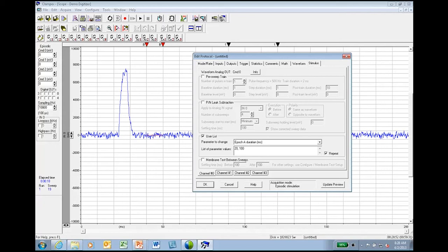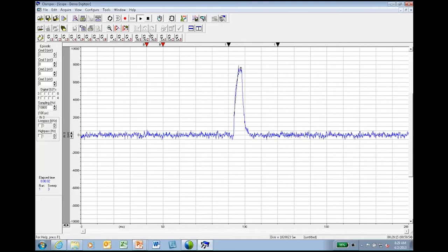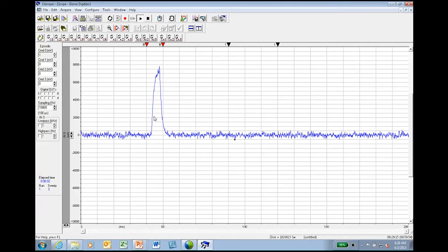Of course, you can also make it more challenging. You can type, for example, 10, 20, and then you can also go to 90, and then come back to 40, 30, 40, 50, 60, 70, 80, and 100. Just to give you an example, and hit OK. When I do this, you can see it goes to 90 and comes back to here, right? So I think this one is very, very useful.